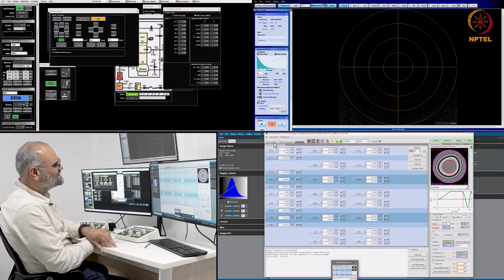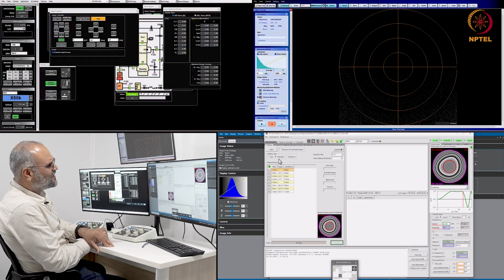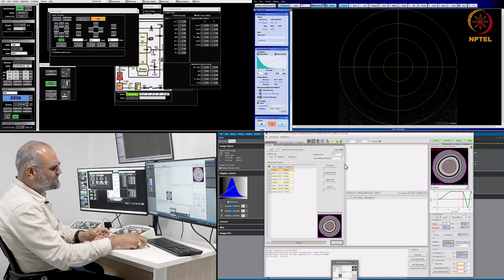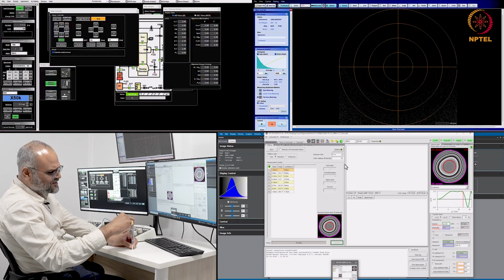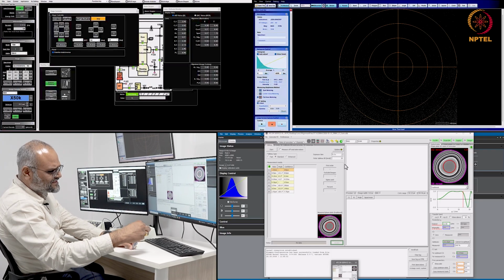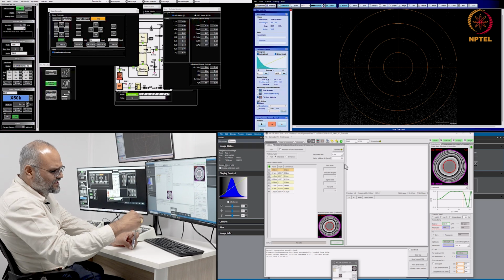If I go to this measurement here, by obtaining a tableau, this is actually called a Zemlin tableau, by tilting the electron beam. Imagine this is the electron beam, illuminating paraxially. I can tilt it through an angle of 15 milliradians or 20 milliradians, and I tilt it at various orientations.